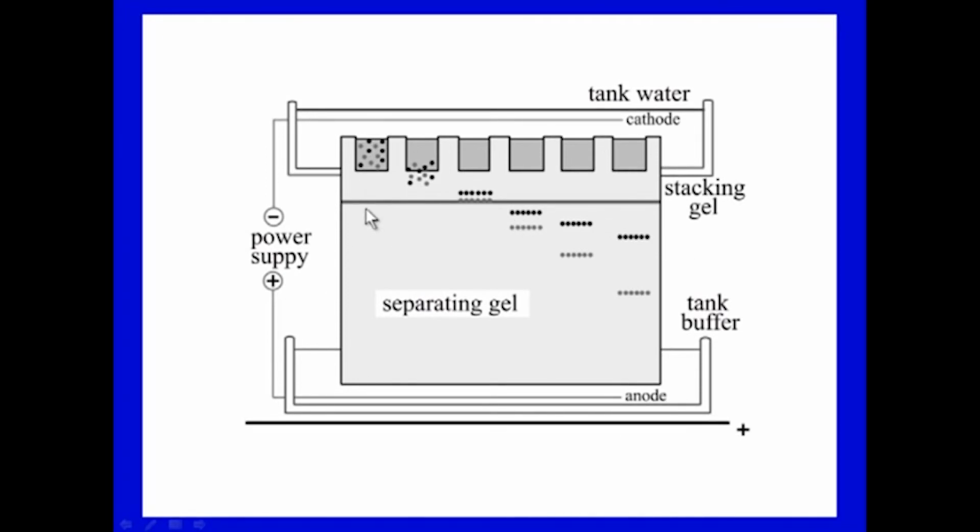If you can see, most of the plate is covered with separating gel, and there is a very small part of stacking gel here. You load your samples in these wells, and these samples are distributed here, big, small, but they form boundaries here, thin zones. When these thin zones enter the gel at the interface into the resolving gel, they will separate according to their size and charge. So, this is how the discontinuous system works, and it is very well depicted here.